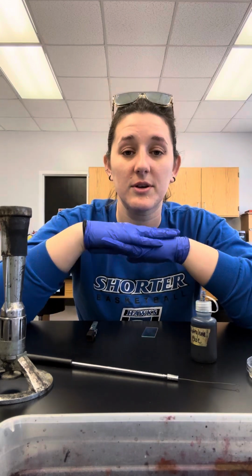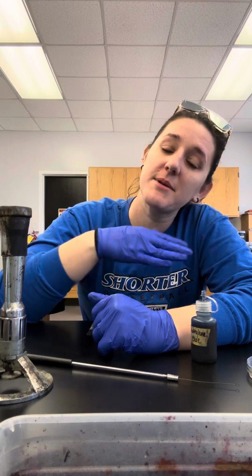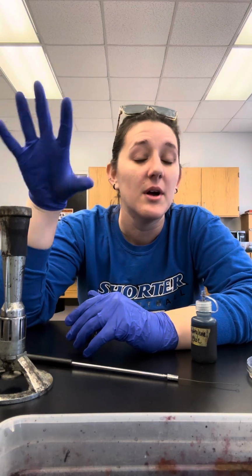All right, so y'all have my demo for gram stain. You have my demo for negative. So what I'm doing is I'm going back to the beginning and I'm going to do a demo for simple.